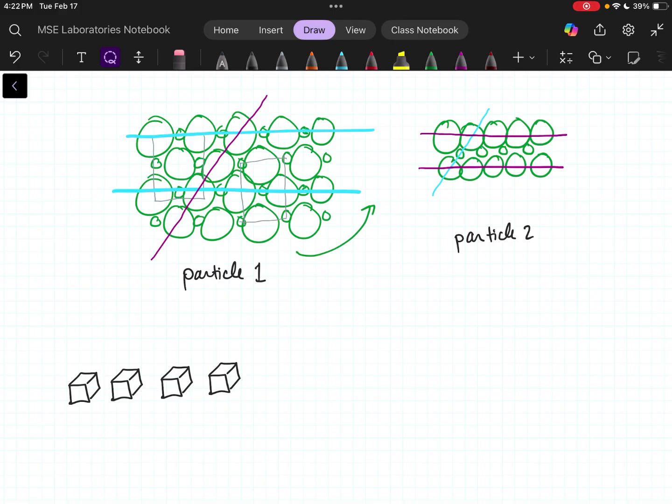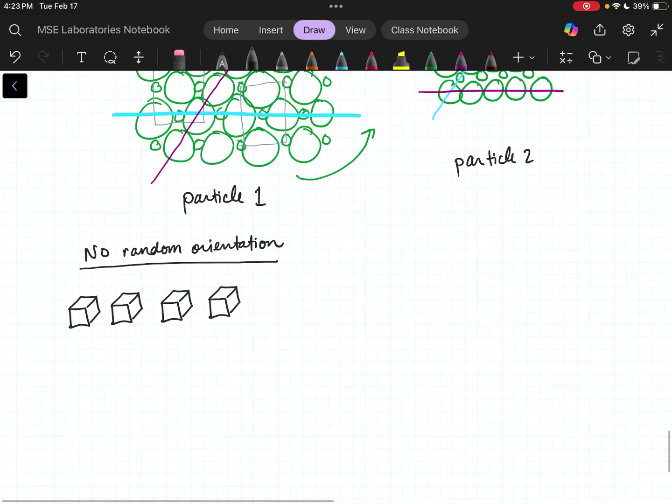Salt has this fun thing where even its tiniest little particles are cubes. And so if I were to just lay them all on a glass slide and I have one thin layer of salt cubes, there is not going to be random orientation. This is just as bad as running a single crystal, because I just have one d-spacing that's going to be represented here.